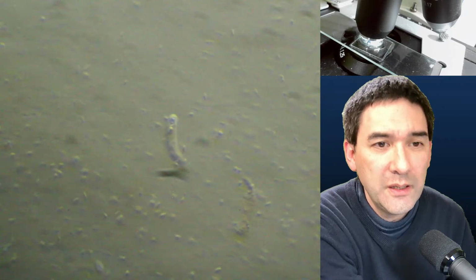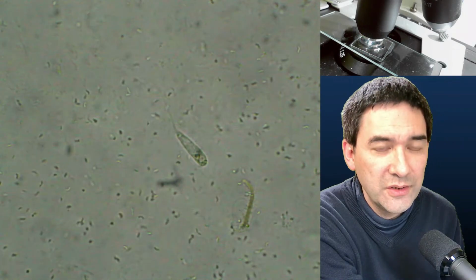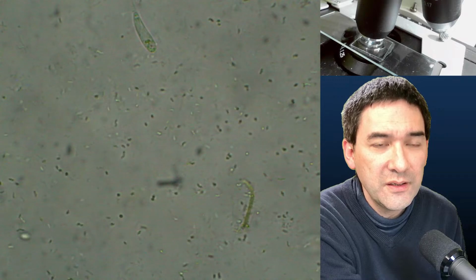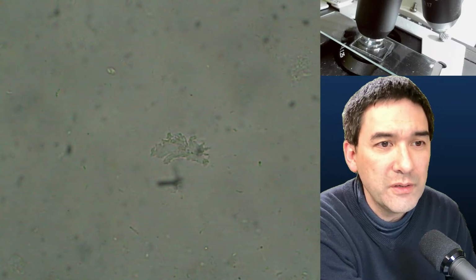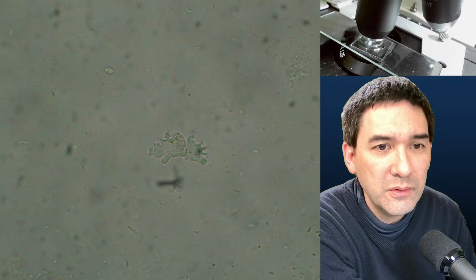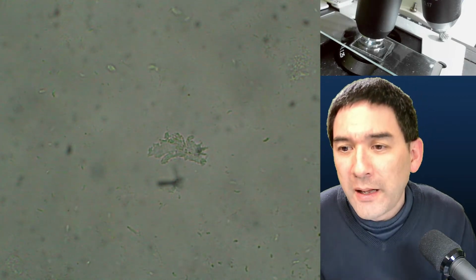Yeah. And let's have a look again, completely on the bright field. And in this case, you close the condenser. And now you're seeing the whole thing a little bit more flat. But you're able to see the colors also a little bit better this way. Is this an amoeba over here on this side? Is it moving? I don't know.